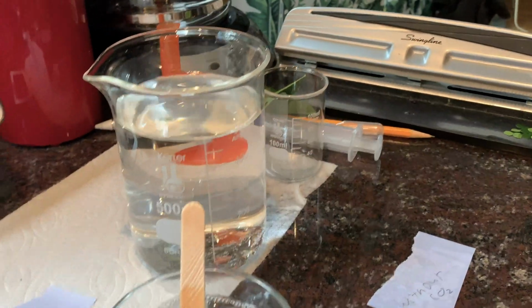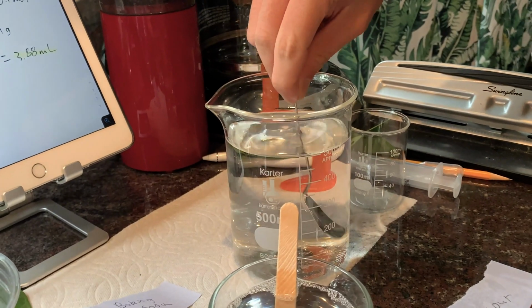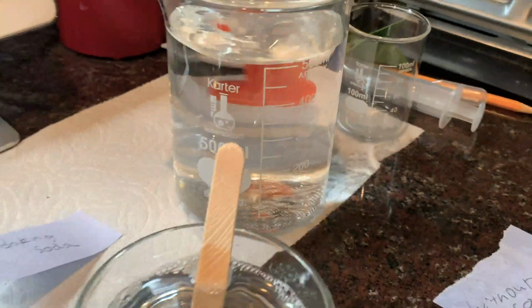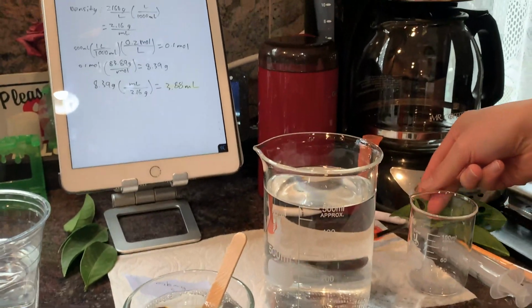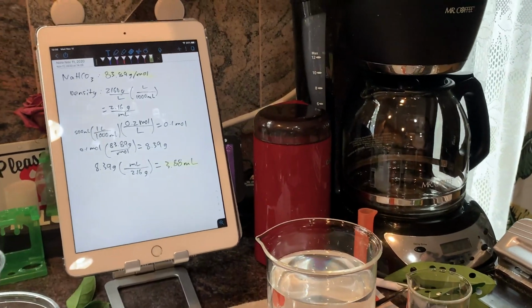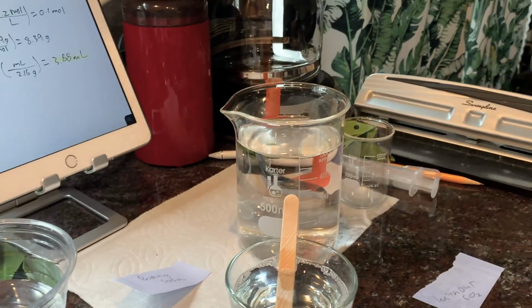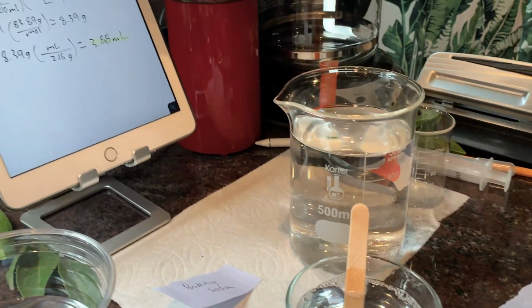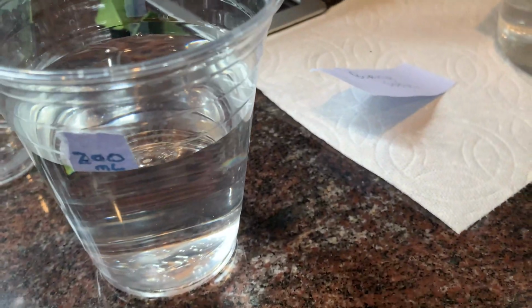And then we'll stir this to get it spread out more evenly. Use a spoon to do it. Okay, so this is our 0.2 molar solution of sodium bicarbonate, which will give us the source of carbon dioxide that the plants will use in their photosynthesis. Now, for our cups, we're gonna put 200 milliliters of this solution in only one of the cups, and that will be our group with carbon dioxide.